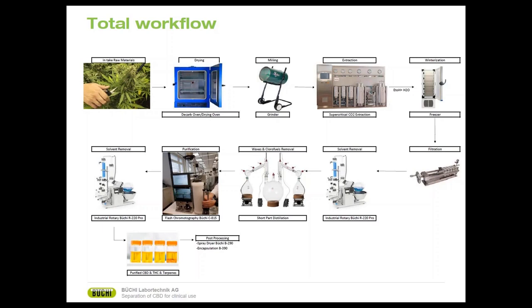Once we have the clean oil, we can also decide to do the post-processing or not. What we say as post-processing, you can do crystallization, you can do spray drying to get the powder isolates, or you can do encapsulation to make capsules out of it. So now we will go into more detail.